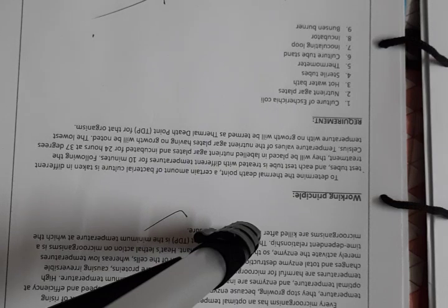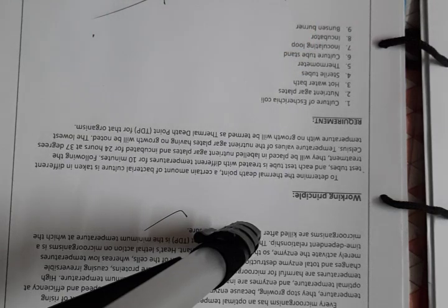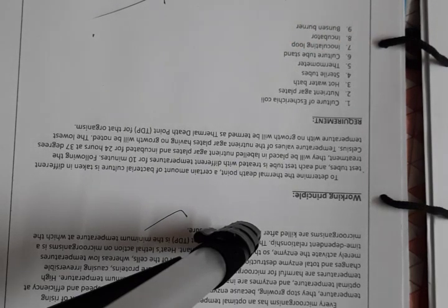And what do we need? I guess I've said everything. I can't remember anything more. That's it, I guess. And as said, we need a culture tube stand for making this tube stand. And one more thing we need actually is the autoclave, because the nutrient agar medium actually needs to be sterilized, right? And the test tubes too. That's why we need that.